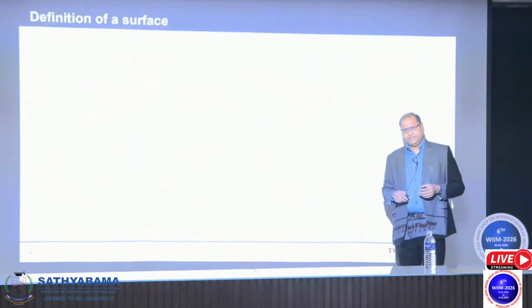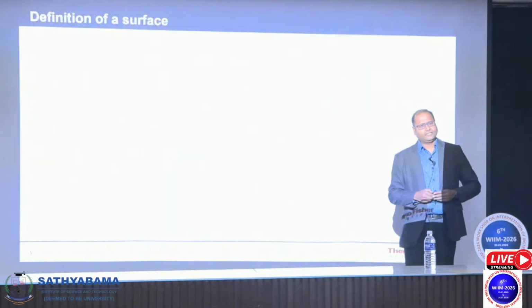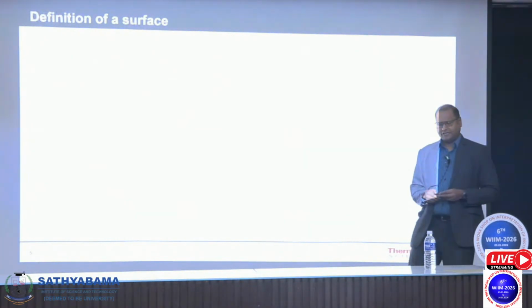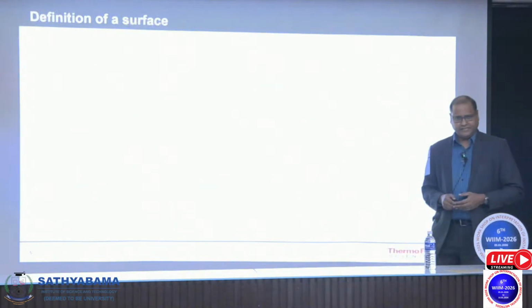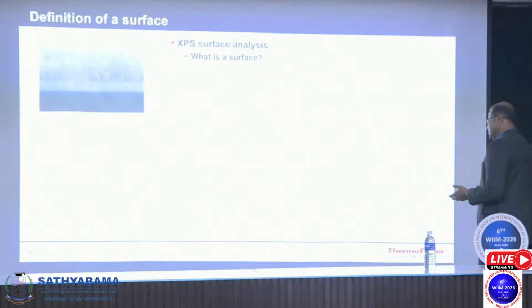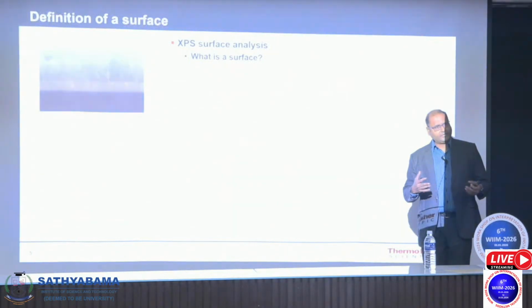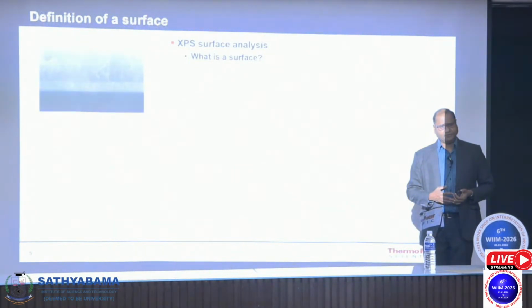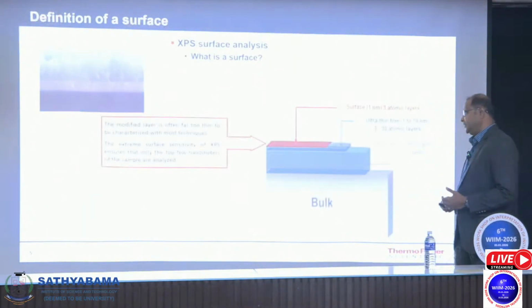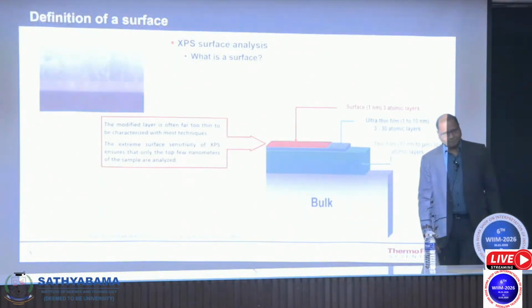And if you've followed me in the last 5 minutes, you would have seen that I keep repeating the term surface again and again. And I'll be repeating it again as well. So what does a surface mean? Why do I keep repeating that surface? Any sample that you take, either it can be a bulk metal, or a powder, or a fiber. Any sample that you take can be divided into certain regions depending upon the depth or thickness.